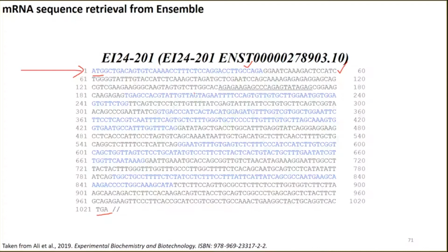If the reverse and forward primers are designed on different exons, for example, this is E1, and this is the intron, and this is exon 2, E2, then even in the presence of DNA contamination, the primers will not give false positive results, because this span is so long that it will not be amplified during a 30-second extension. For example, in qPCR, we give a 30 to 40 second or maximum 1 minute extension time.